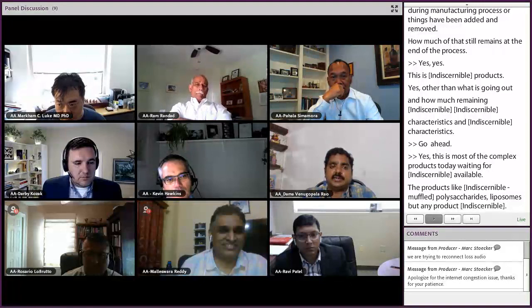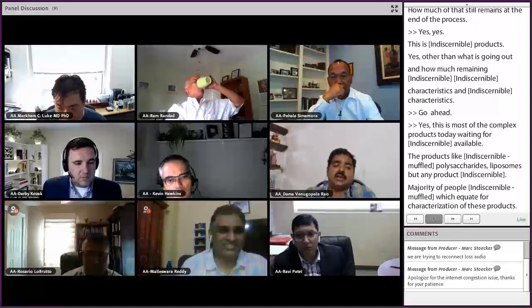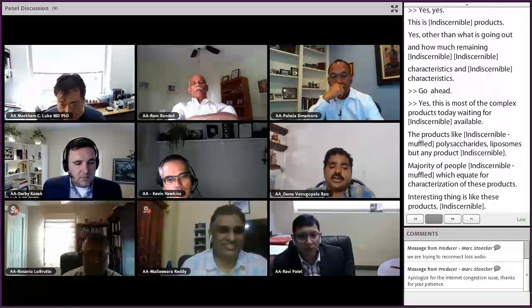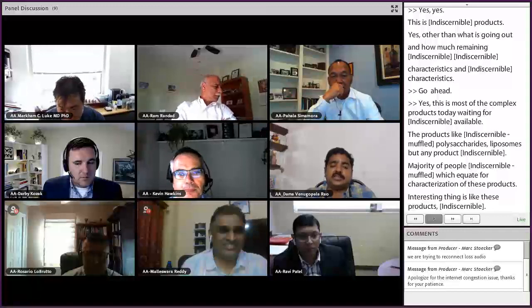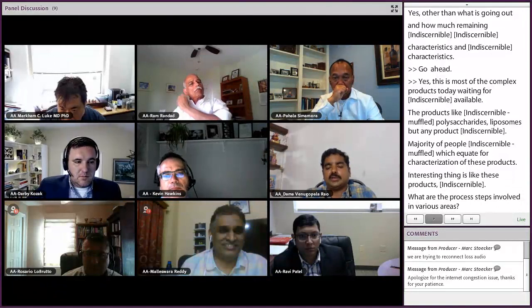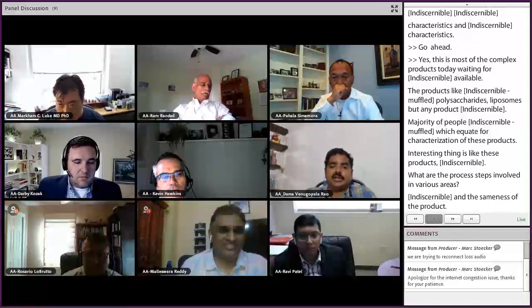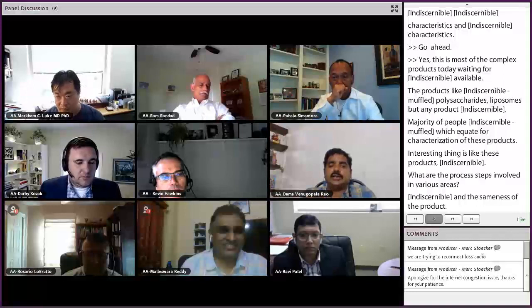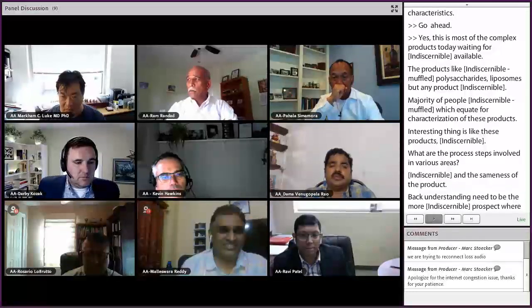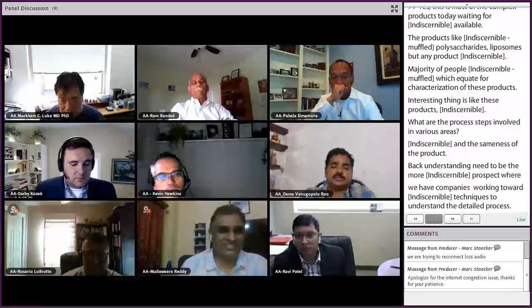So what are the process steps involved, and at various stages, what are the right CQAs to control at intermediate stages in order to ensure the right sameness of the product? That understanding needs to be more developed from an industry perspective. A few companies are working in that direction, using PAT controls as well as offline analytical techniques to monitor the right quality attributes at each process stage to end up with the final sameness attributes. That is what is most important for all these products. That's what I think.